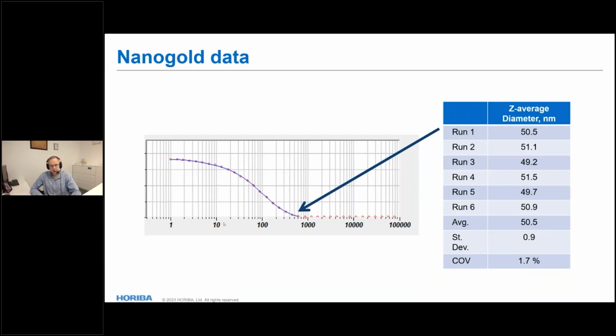To stuff it all into a graph we can look at, we make it this semi-log plot, and you often see these backwards S shapes. So from where it sits down, that gives you a sense of the size if you're used to your instrument, or you let the software do it for you. That's the most popular technique.